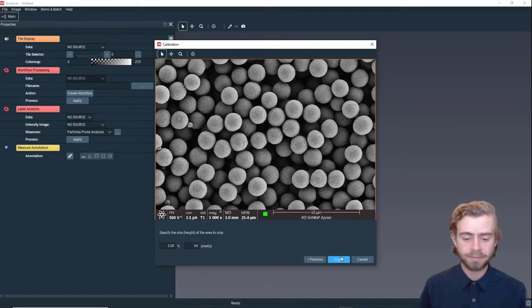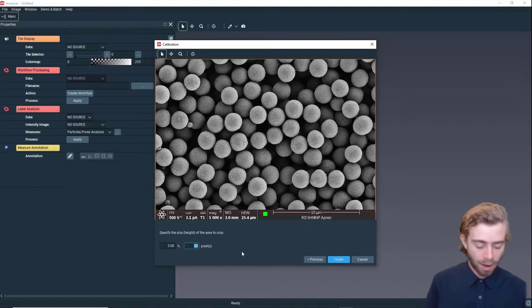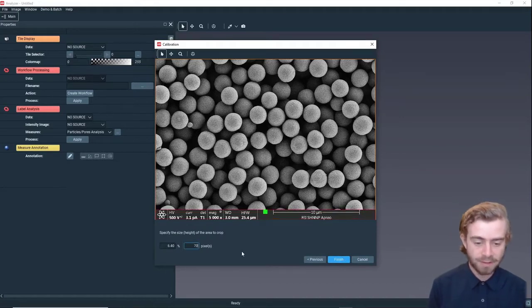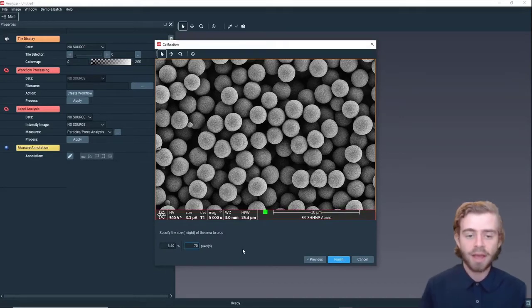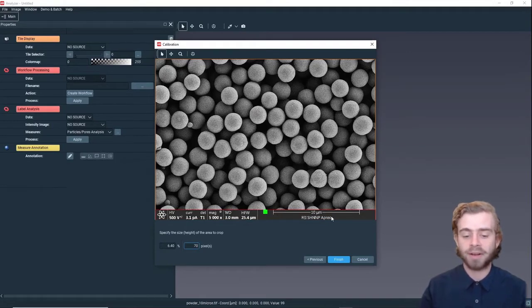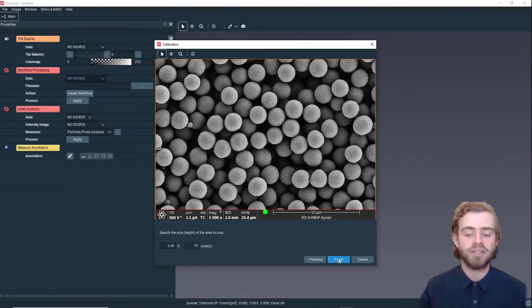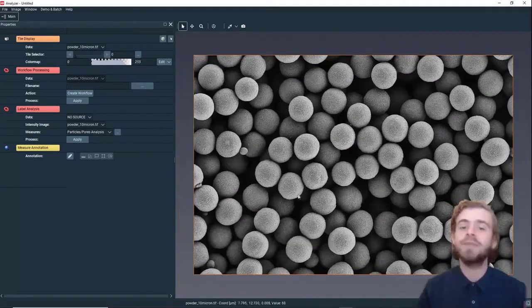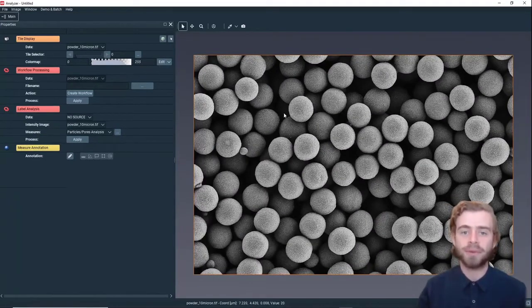There we go. Next we're going to crop this, so we're going to set this to 70 pixels. This is a good crop of the image because we just don't want this bottom part in it, and we're just going to click Finish.